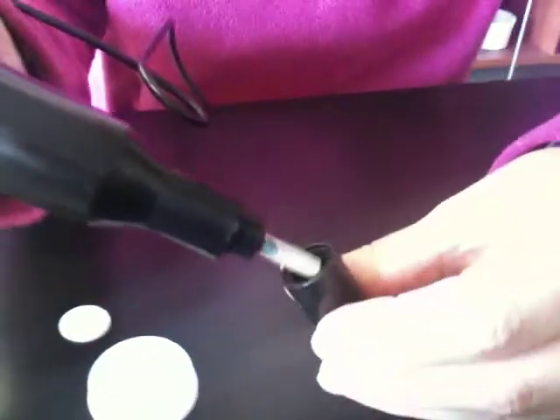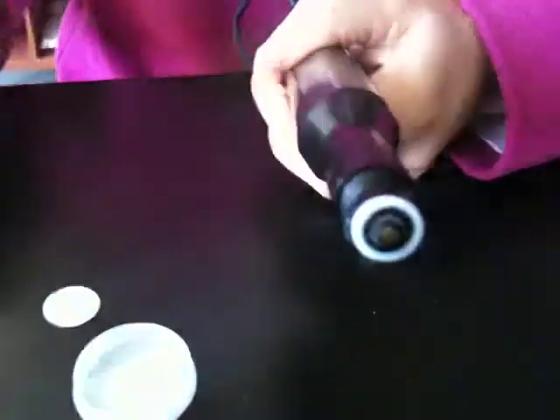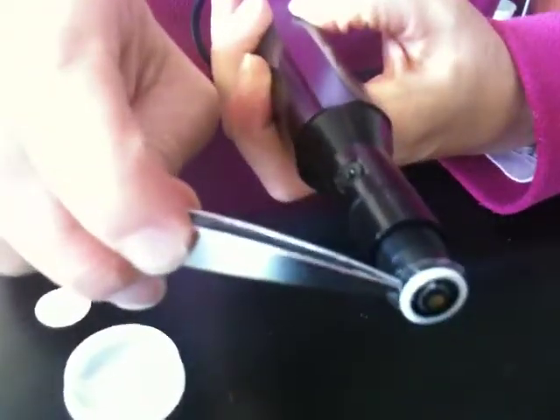If you don't see any liquid, you're going to need to replace the solution as well as the diaphragm in some models. Some models you don't need to replace the diaphragm, they just have a cap. But in this model we've got to do that. So now you grip the lower portion of that cap, twist off, and what you see is the O-ring, which is the white portion, and sort of the cellophane portion, clear, which is the diaphragm.